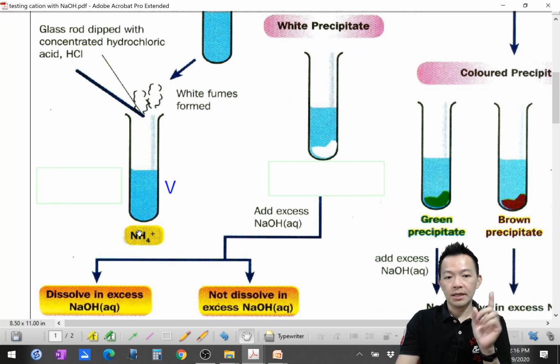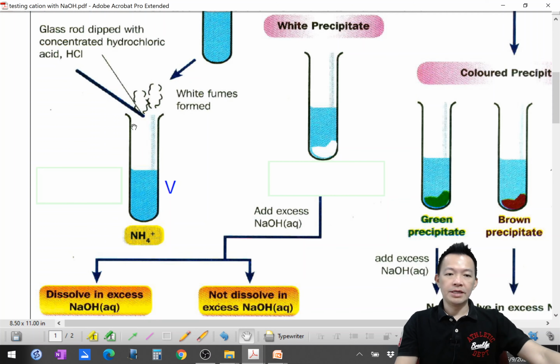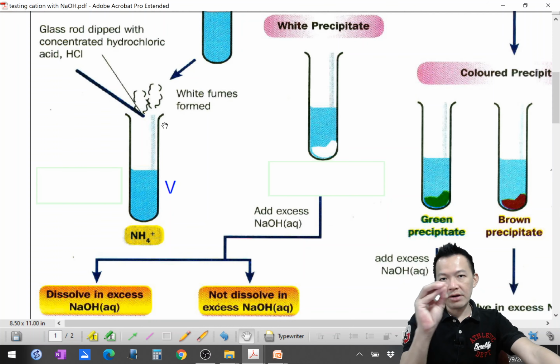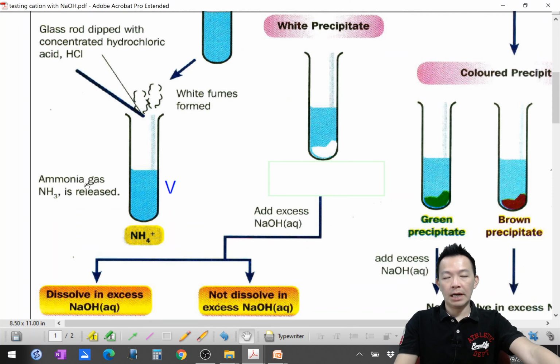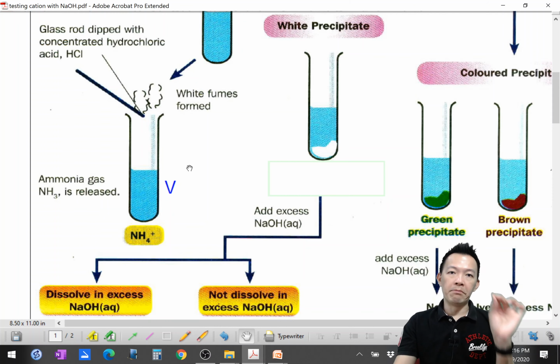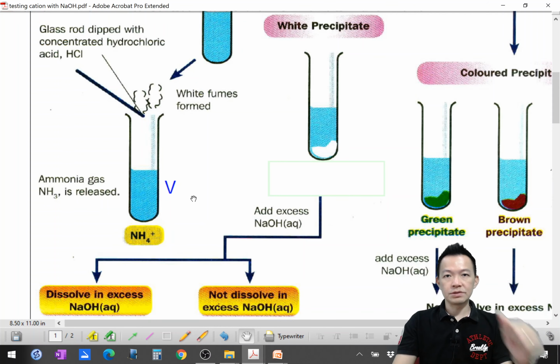You can use another method. When you heat the ammonium salt solution, ammonia will be produced. You can test the ammonia gas by using concentrated hydrochloric acid, and they are going to produce white fumes. This test also works. Or you can smell it. The smell is very unpleasant. So ammonia gas will be released. If you heat it, it will release ammonia. Ammonia can be tested with litmus paper, or tested with concentrated hydrochloric acid. So this is a test. Okay, ammonium salts, this is how an ammonium salt is tested.